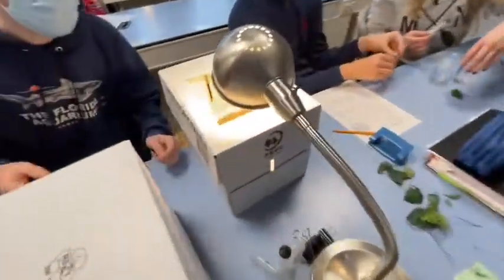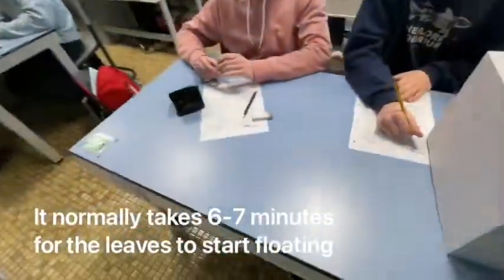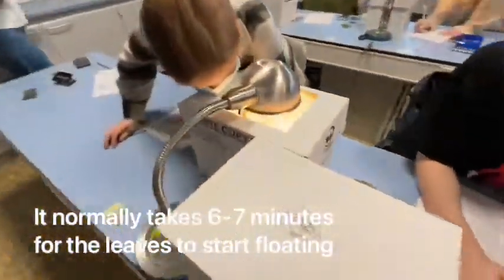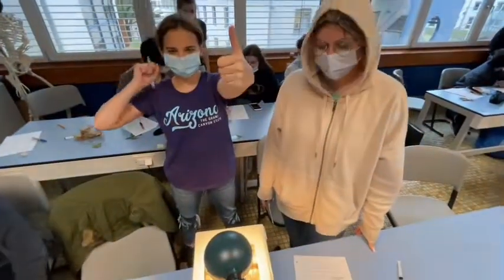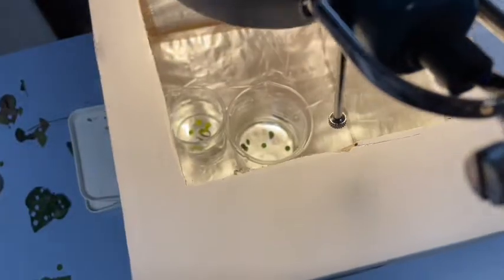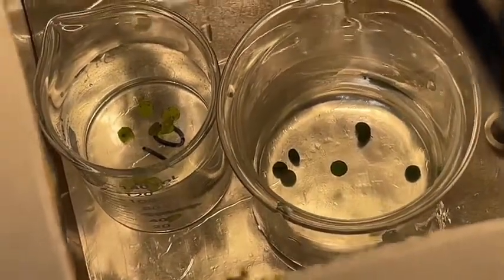All right, are they floating in the light? No. They aren't. Oh man. All right, we're only 5 minutes through though. Are these floating in the light? No. Not yet. So are they floating for you? Yes! Why are they floating? Photosynthesis. Well, what about photosynthesis? Oxygen. Oh no, one's going back down!